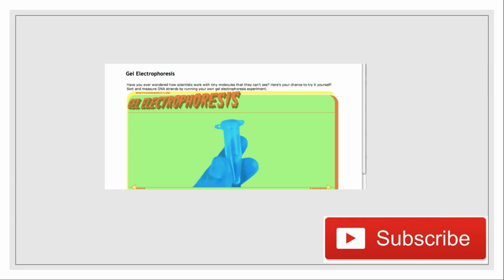So why we use gel electrophoresis is a common question. Scientists use gel electrophoresis for the determination of a band's presence or absence, of specific species, genotypes, or a specific band in a specific person. So here you have your chance to try it yourself: sort and measure DNA strands by running your own gel electrophoresis experiment.